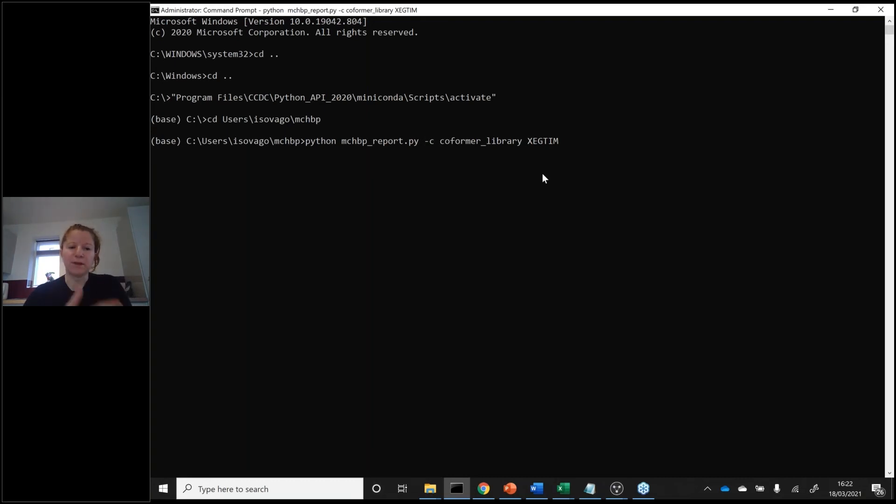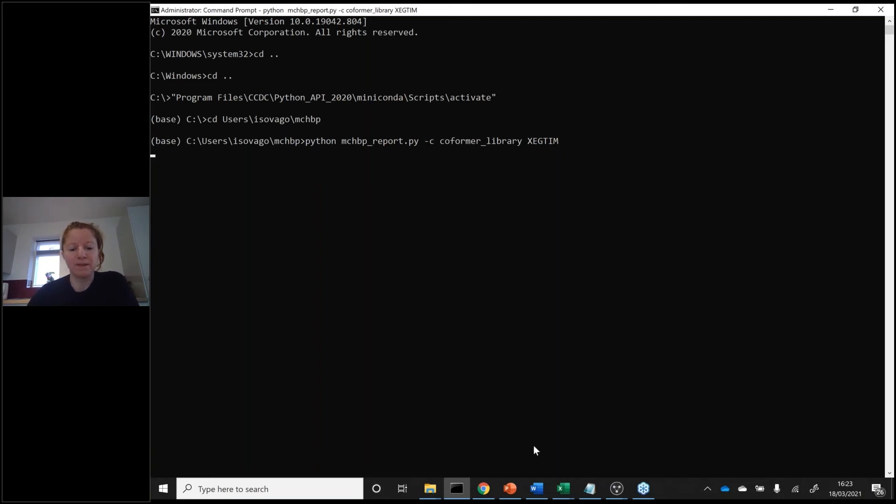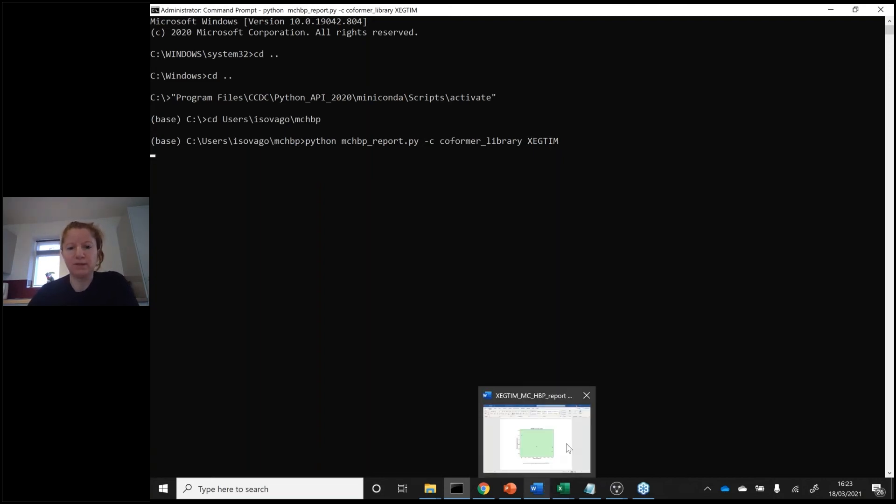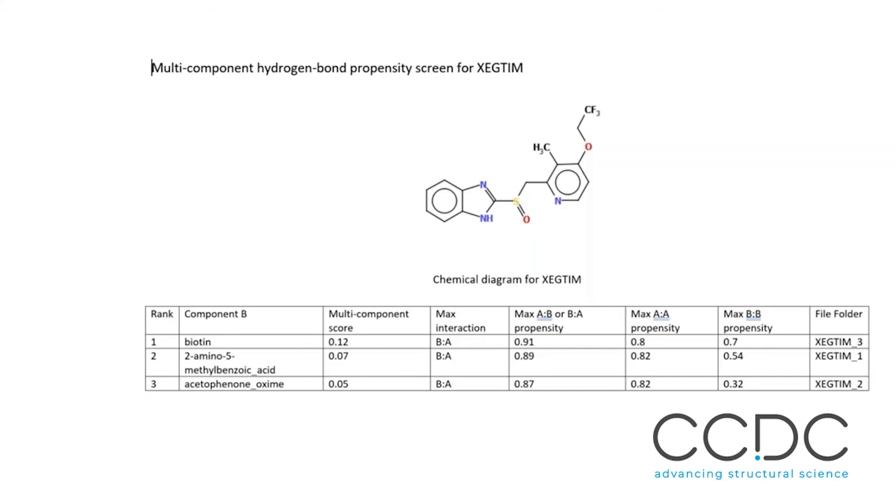As I said, this is quite time consuming, so we'll not look at it running to the end. I pre-ran it already. Basically at the end, you will get a report in Word document format with the table I showed you on the slides and the 2D molecule of the target molecule.